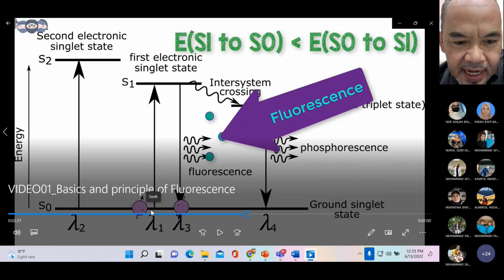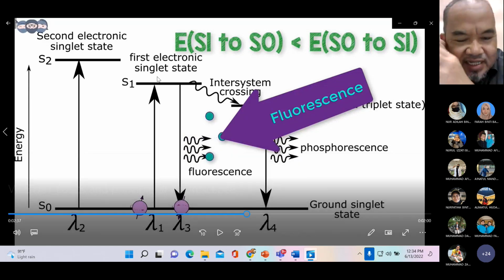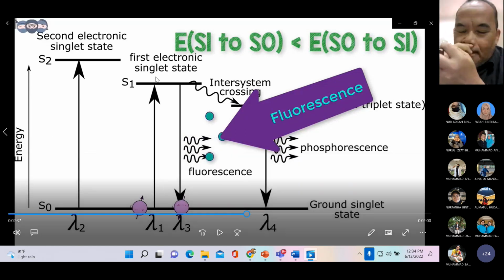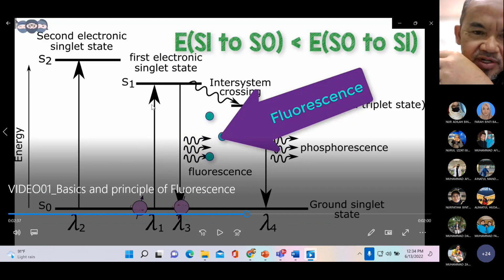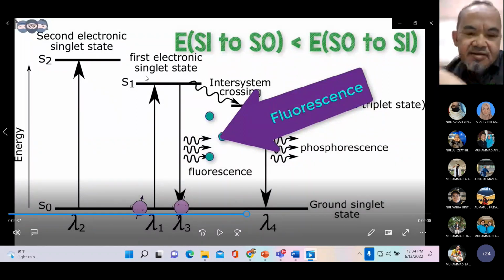elektron dia akan mengambil foton dan dia akan excited. Okey, dia akan naik atas. Dekat atas ni, masa dia naik atas ni, ada sebahagian molekul ni dia bergetar tau. Dia bukannya senyap-senyap macam tu. Dekat bawah ni pun dia bergetar, dekat atas ni pun dia bergetar juga. Dan getaran tu dia akan menyebabkan energi tu dibuang ke kawasan sekitar.